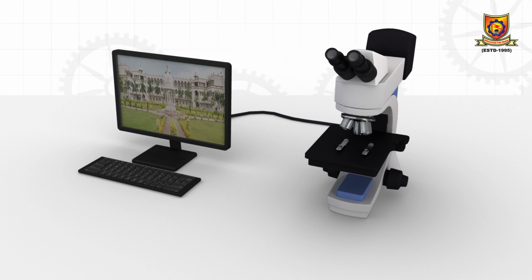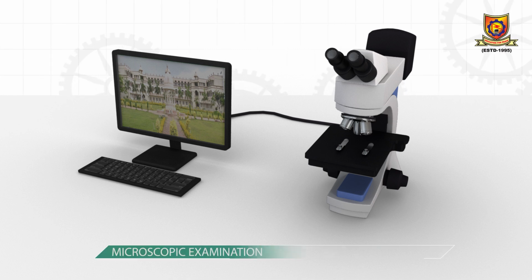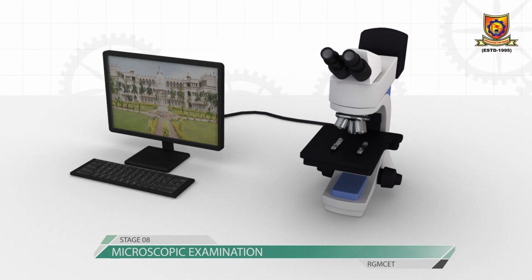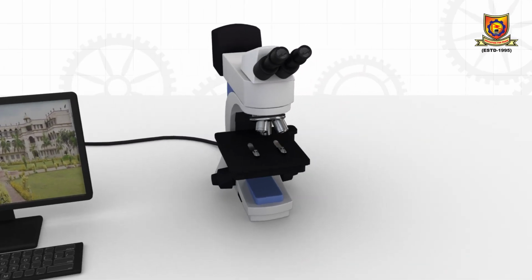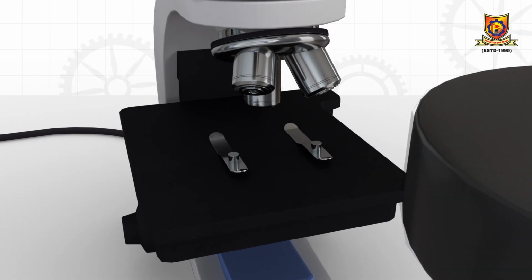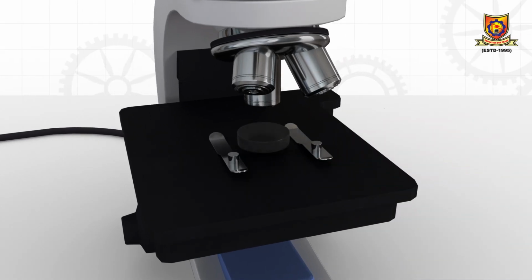Once the etching operation is completed, we have to rinse the sample under a stream of water, and dry it with the help of compressed air, and that dried specimen is placed on this metallurgical microscope. If possible, we have to use an adhesive agent for mounting the specimen.